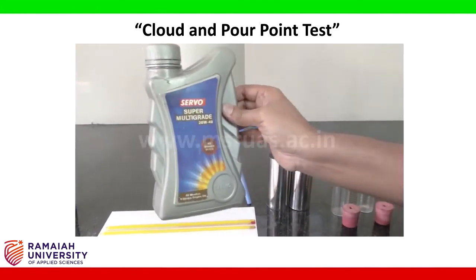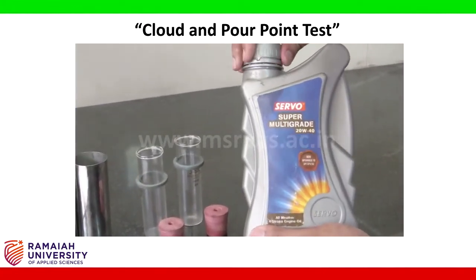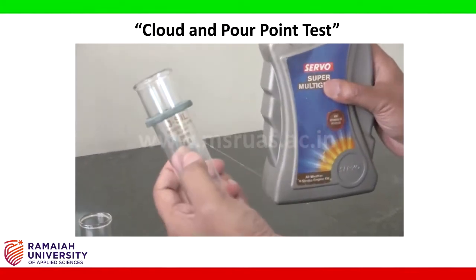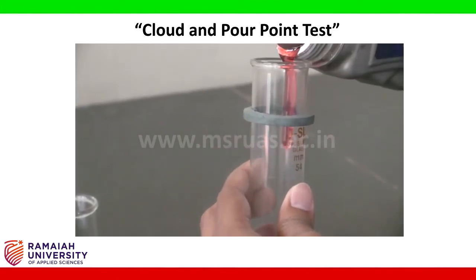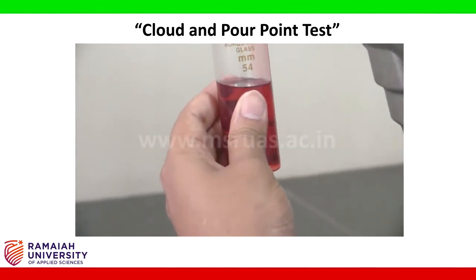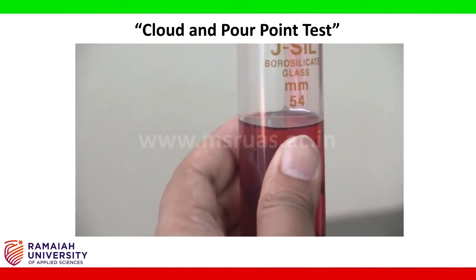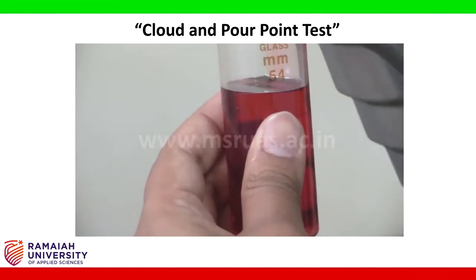One of our samples is 4-stroke engine oil, which is 20W40. Take a test tube, fill the sample up to the mark. Place the cork.